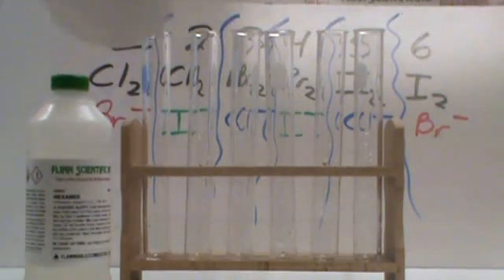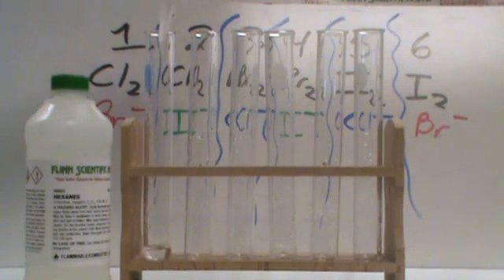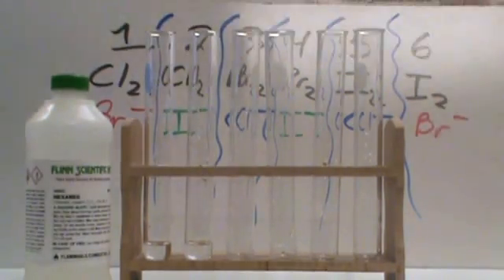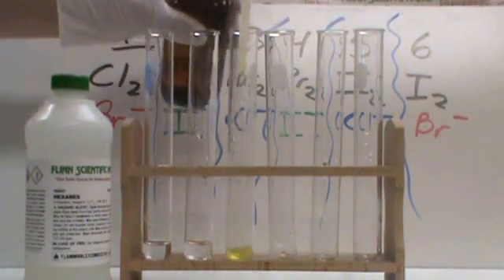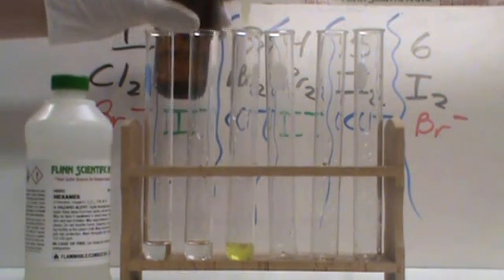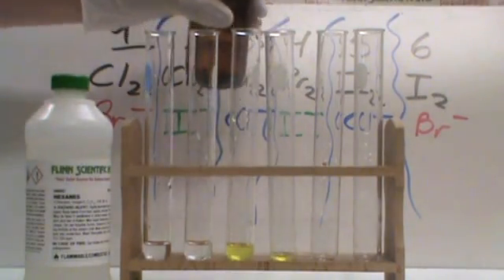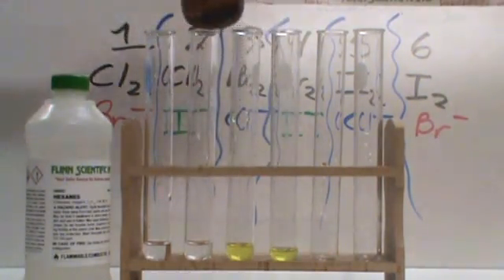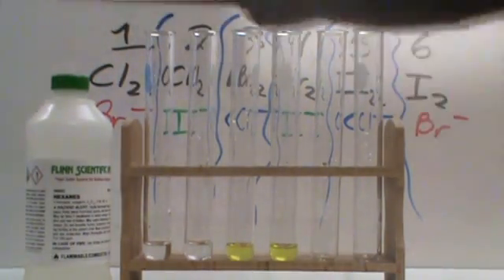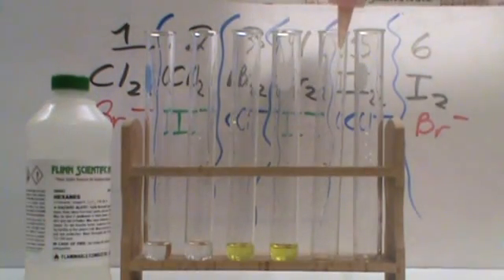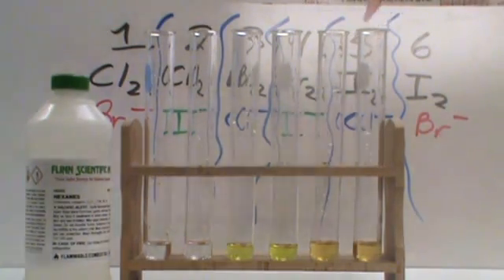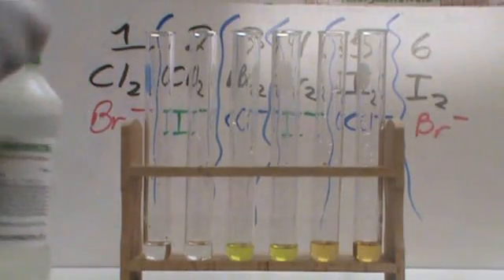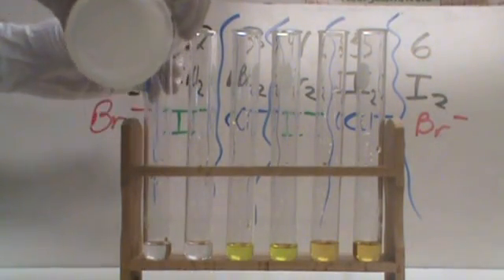In the first two test tubes, we're going to put some chlorine. In the next two test tubes, we're going to put some bromine. Keep track of the colors here. The chlorine water is just clear and colorless. Bromine has a hint of yellow when it's in water. The iodine is kind of purplish, maybe a hint of brown. The first thing I'm going to do is put hexane into each. That's going to change some of the color schemes based on how it interacts with each.